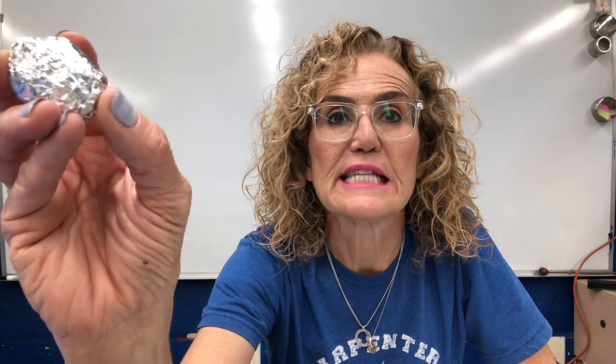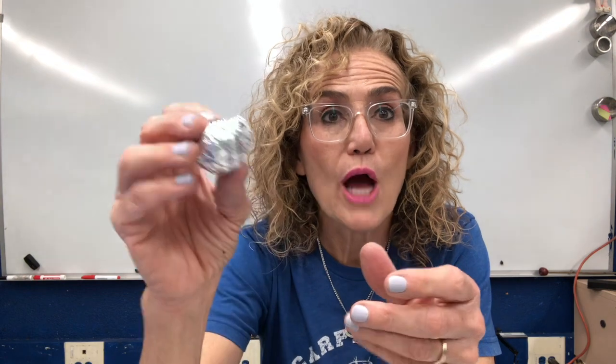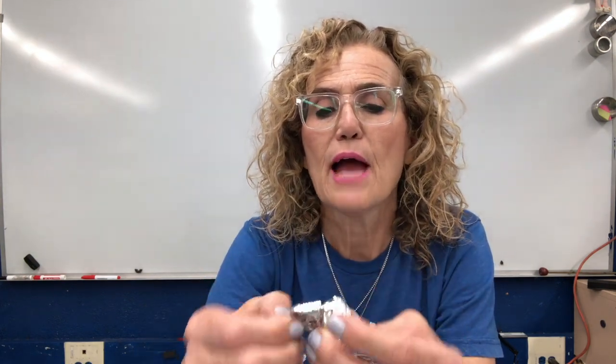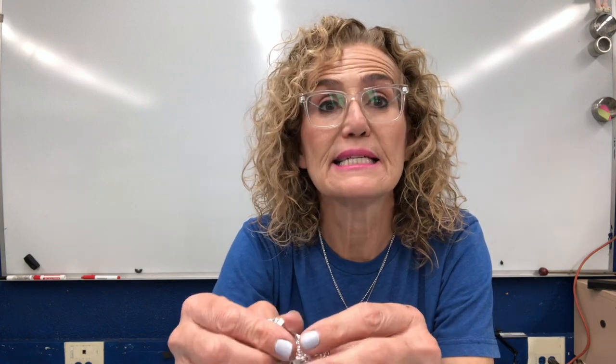Number 5, I want you to predict the number of skulls you think might be in here. The skull is just the head of the mouse or the rat that you're going to find inside. How many skulls do you think you're going to find? Write it down. And then we're going to write down how many you actually find when we open up the pellet. So now we're going to open up the aluminum foil packet, and we're going to see the pellet that's inside.